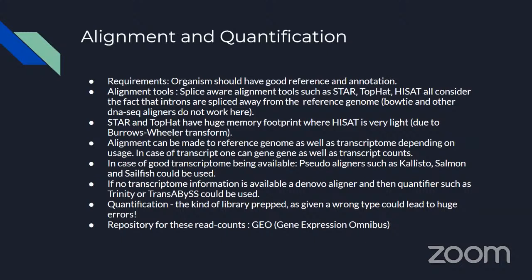So, for example, when you're selecting by poly A tail, you are selecting the mRNA, and then it is converted into a cDNA, and the complementary strand is created and everything. In such a case, it is reverse transcribed. We call it reverse transcribed because, since it's a cDNA, it goes in the opposite direction. So STAR actually gives you the counts for all the three conditions.